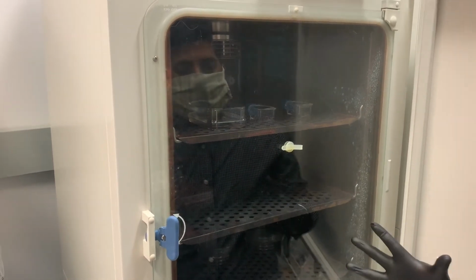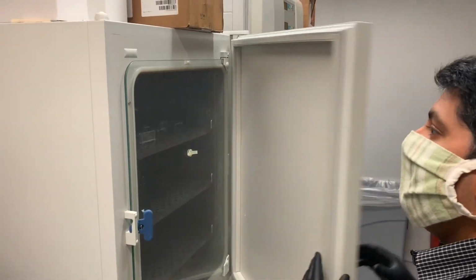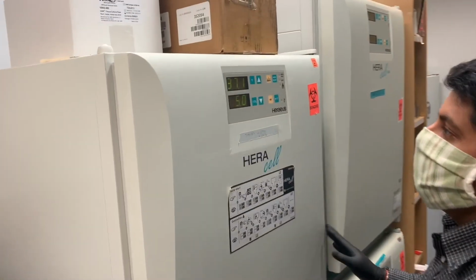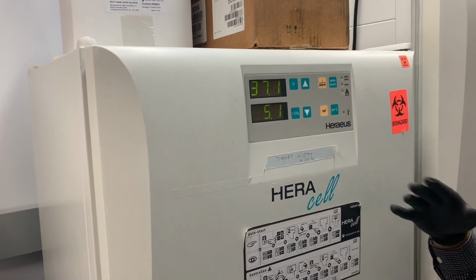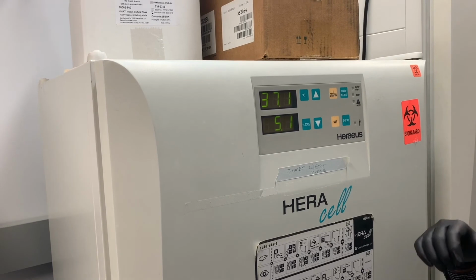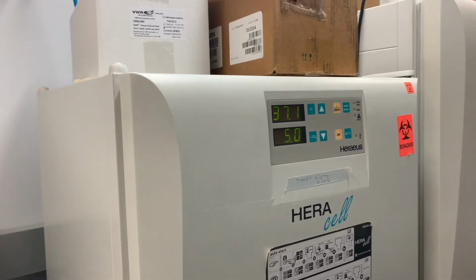In order to maintain the optimal conditions for growth and survival, each of these incubators has a certain temperature that they're set to, a certain amount of humidity, a certain oxygen concentration, and a certain carbon dioxide concentration that are closely monitored and closely set by the incubator.